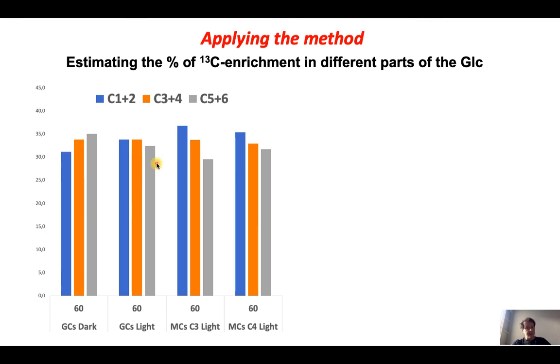So maybe it's one effect of low photosynthetic rate, or given this is higher here in the dark, maybe gluconeogenesis has been activated. These guard cells here are under bicarbonate. When you label tissue with bicarbonate, at least in animal tissues, you get enrichment in C3 and C4. So the labeling of C3 and C4 in this case is probably a result of gluconeogenesis.